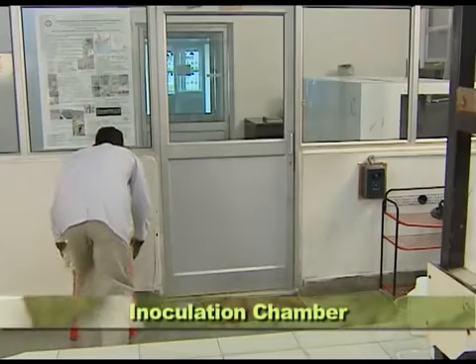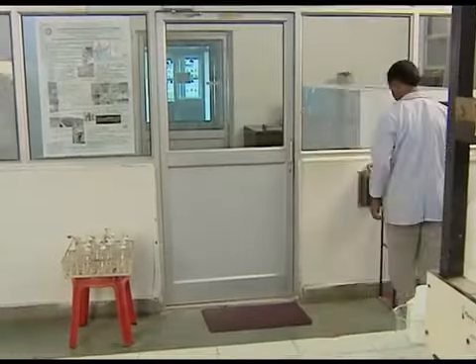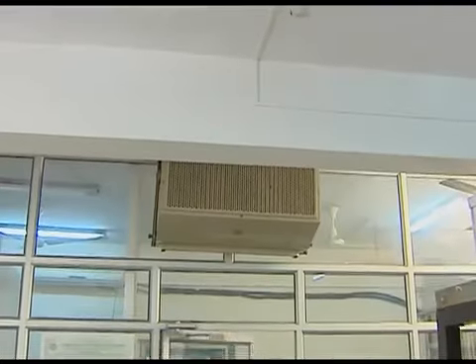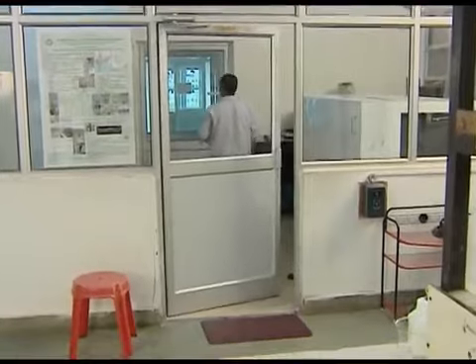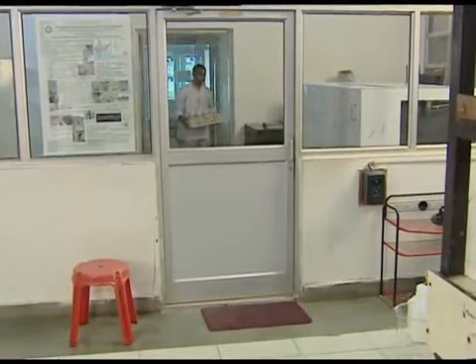Prior to entering the inoculation chamber through the double door, it is important to wear a clean cotton lab coat and take an air shower. Inoculation means transferring plant specimen into the media under aseptic conditions.